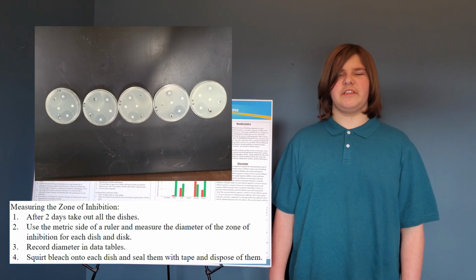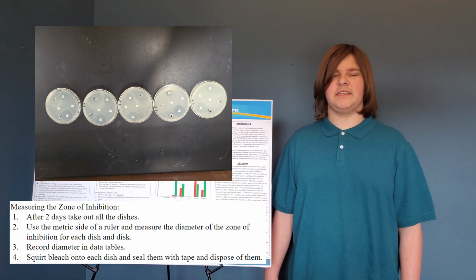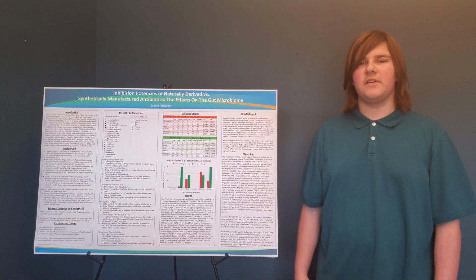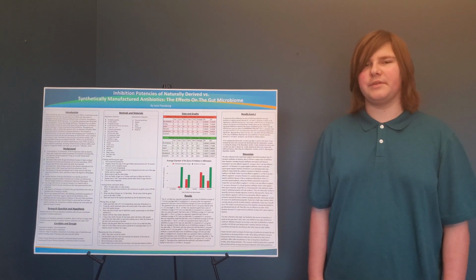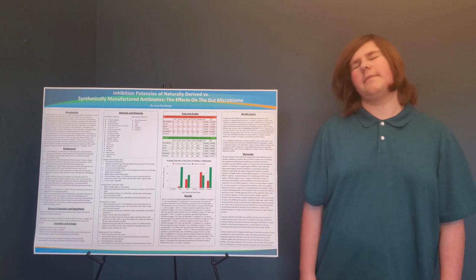I disposed of the dishes by squirting bleach into each dish, sealing with tape, and placing it in the school's biological waste bin. The antibiotics I used for my tests were ampicillin, penicillin, and gentamicin. The natural remedies I used for my tests were honey and garlic.